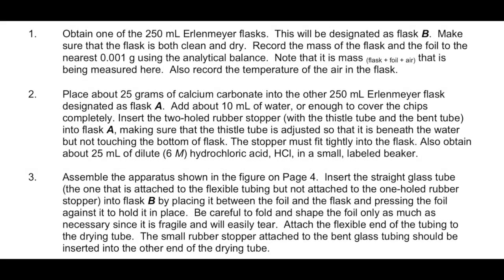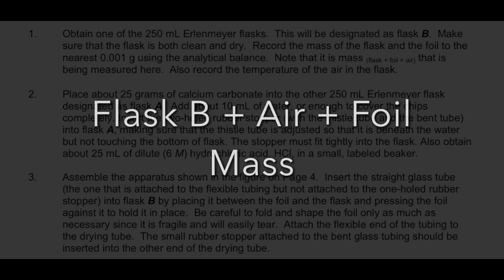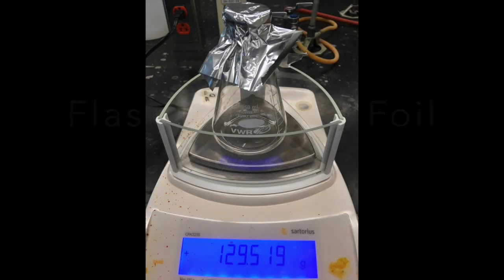Let's take some preliminary measurements. First we will take our collection flask, flask B, and get its mass — with the foil and with air inside. Record the mass onto your datasheet.